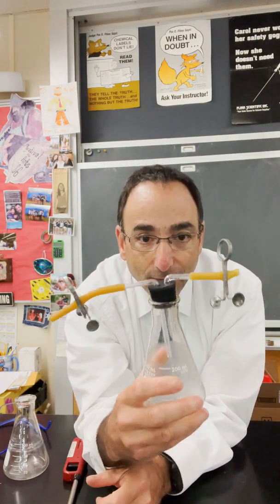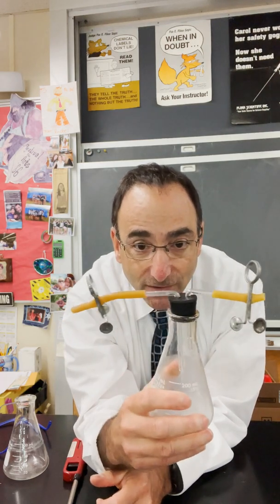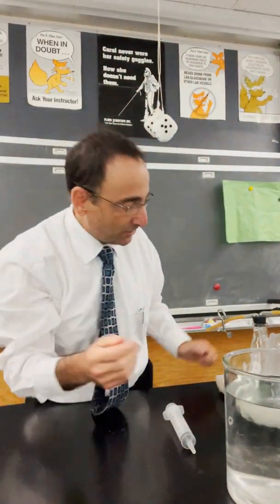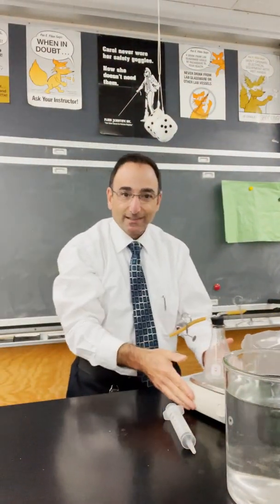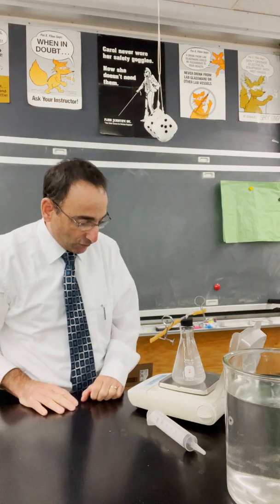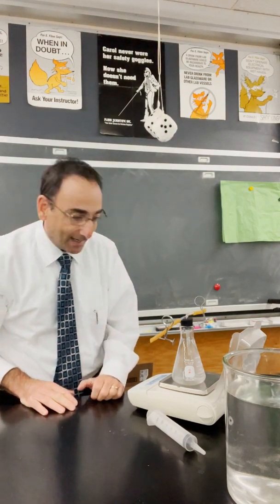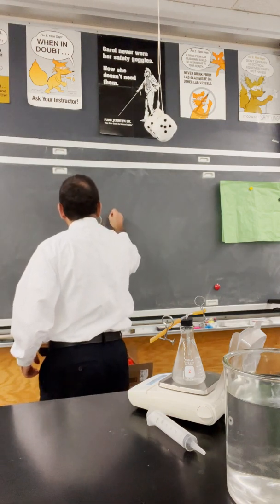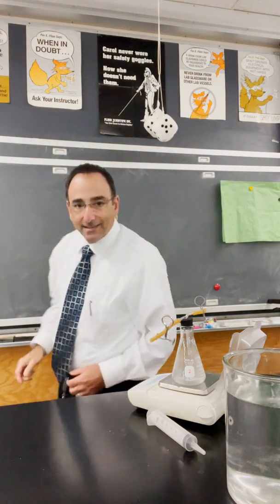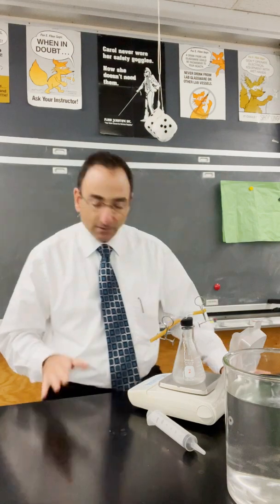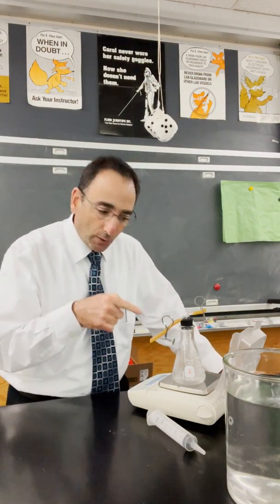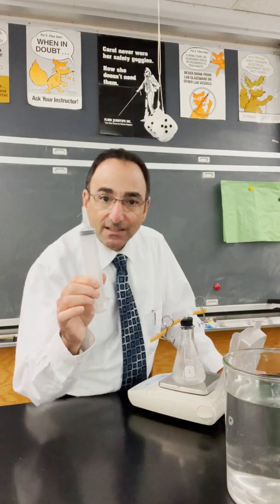We find the mass of this system as it is, so we put it on the digital balance. In this case the digital balance reads 200.99 grams. Now we're going to pull with a 60 ml syringe — we're going to pull the air out of the flask.